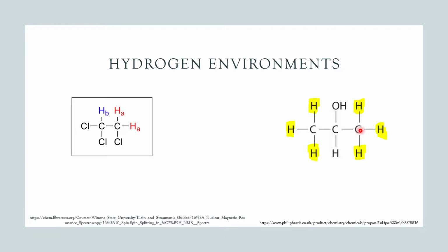So this hydrogen is bonded to a carbon with two hydrogens on it, just like this side. And the carbon is then bonded to a carbon with an alcohol group and a hydrogen, and then a CH3 on the other end, just like the other side. Now, the reason why all of these hydrogen environments are the same comes down to the symmetry that is in the molecule itself. That certainly is an assisting factor. It's not particularly common, but it's certainly possible for hydrogens that belong on different carbons to have the same environment, and that will happen when there's a degree of symmetry there.